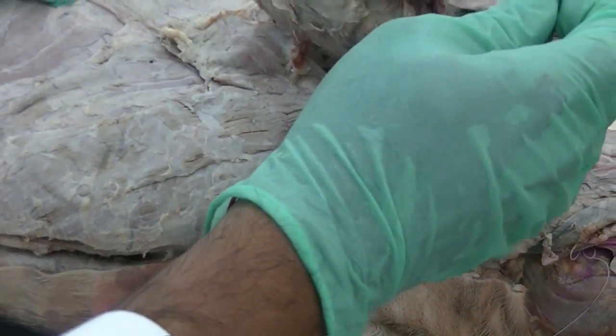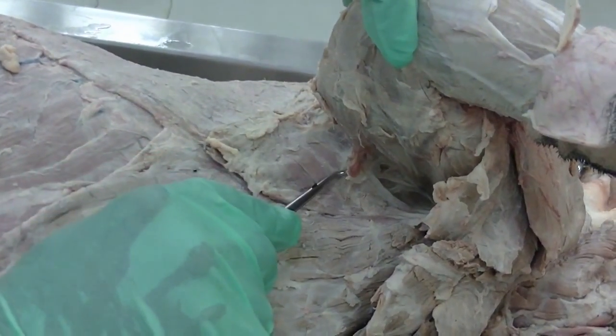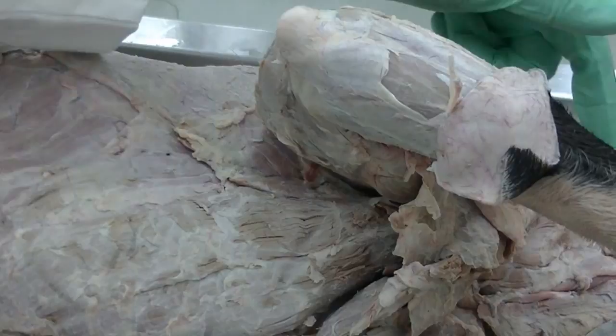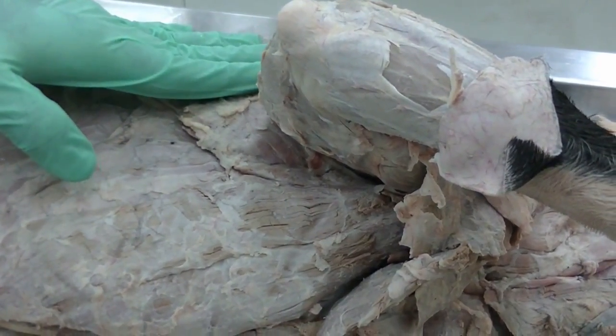In this dissection, we still see some leftover of the cutaneous trunci going deeper to get attached on the medial aspect of the humerus, and the latissimus dorsi can still be seen as we move around the forelimb or scapula, which attaches the forelimb to the rest of the body.